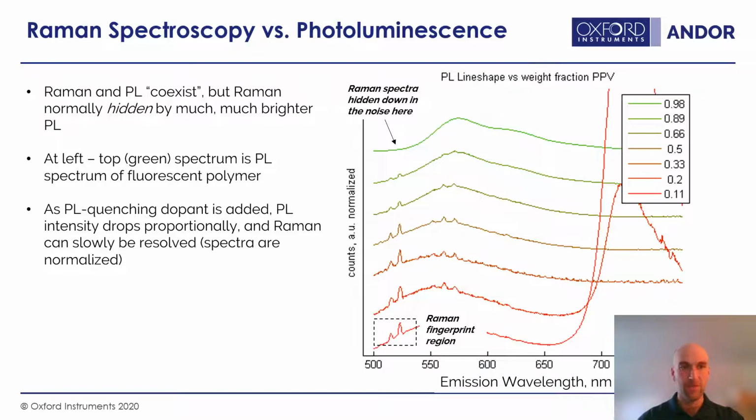So again, here, this is the undoped, and what we're doing in this measurement, experiment is a bit generous, we're adding a quenching molecule that has its own fluorescence in the near IR, but what it does is as you add it, it steals the excitation. When you make an excitation in the PPV, it will grab that excitation and shut off that pathway of emission in the green to red. So the more that we salt in this dopant, the more that it quenches the photoluminescence.